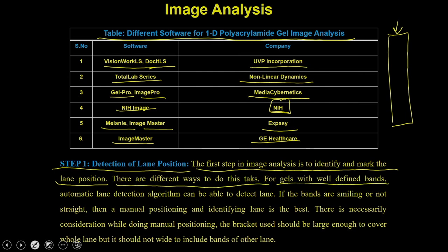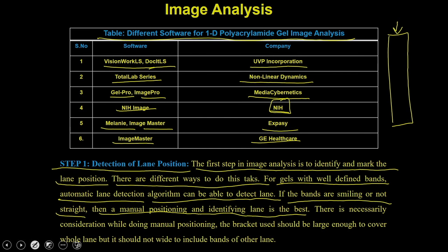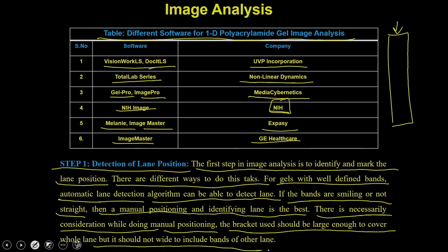For a gel with well-defined bands, an automatic lane detection algorithm can detect the lane. If the bands are smiling or not straight, then manually positioning and identifying the lane is best. There is a necessary consideration while doing manual positioning. The bracket used should be large enough to cover the whole lane, but it should not be wide enough to include the other lane.